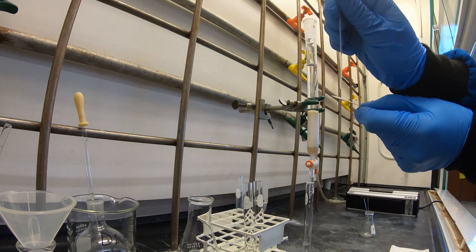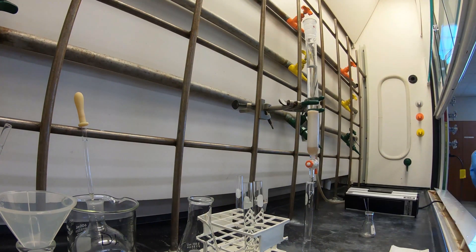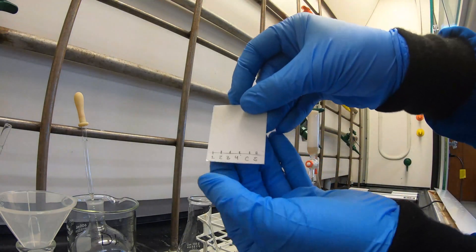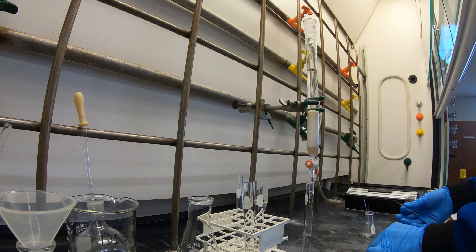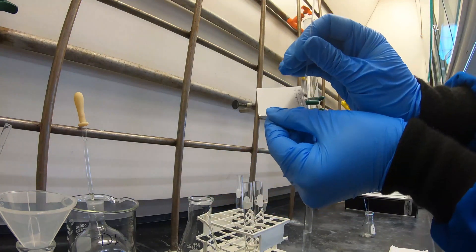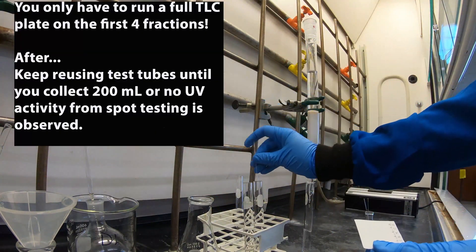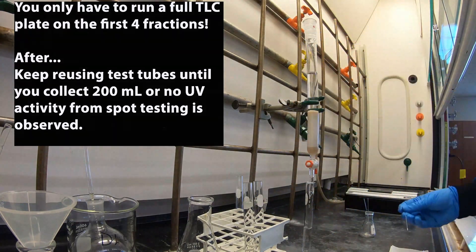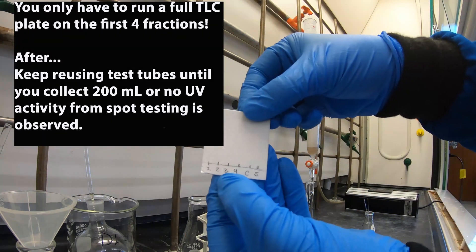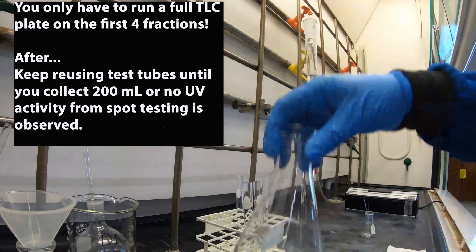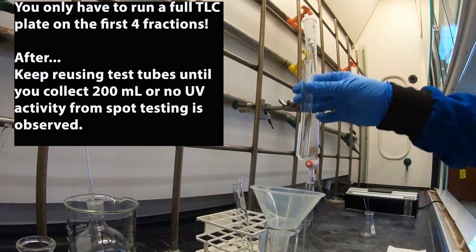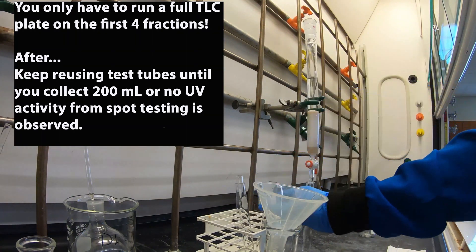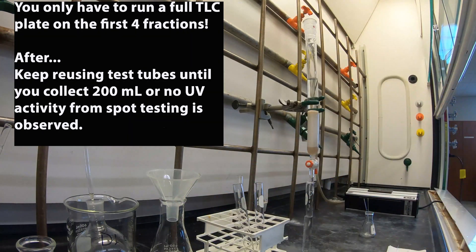Collect four large test tube fractions and then stop your column. Then you're going to prepare an actual TLC plate. You're going to have your four fractions, your standard, and your crude DEET product spotted on this plate. Run the TLC plate using hexanes as your eluent. After running your TLC plate, be sure to circle the products that appear beneath the UV light. You're actually going to continue collecting fractions until you've used 200 ml of hexanes or you're no longer observing product by spotting on the TLC plate and looking under UV light.